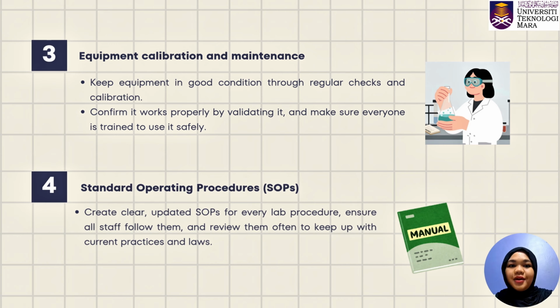Number 4. Standard Operating Procedures, SOPs. Create clear, updated SOPs for every lab procedure, ensure all staff follow them, and review them often to keep up with the current practice and laws.